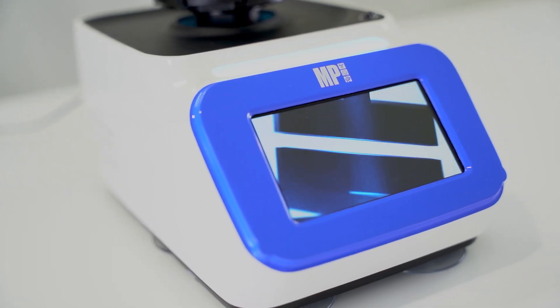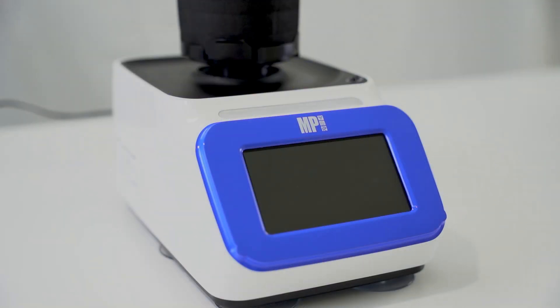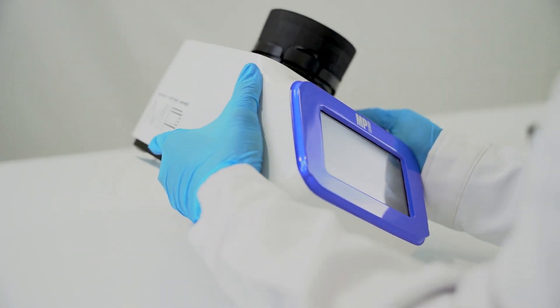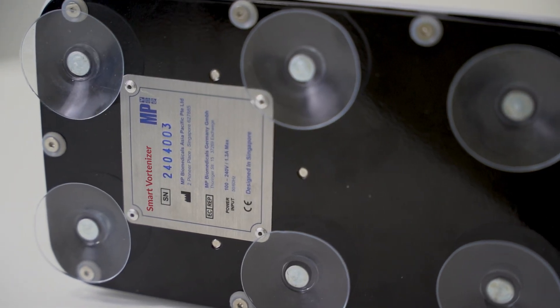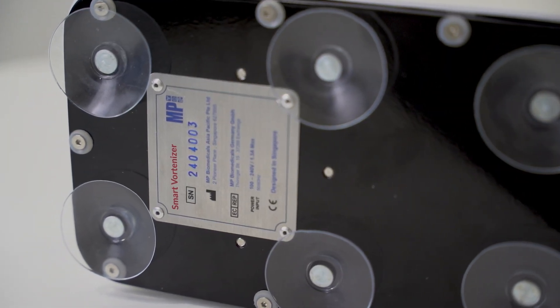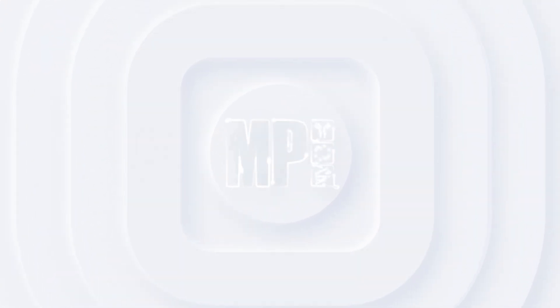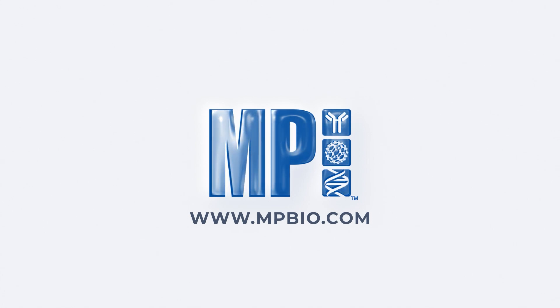Make sure that the instrument is completely dry before switching it back on. If a malfunction occurs that cannot be resolved on the spot, take a photo of the nameplate at the bottom of the machine and contact MP Biomedicals' technical support. Our qualified engineers will be more than happy to assist you. For more information, contact us at mpbio.com. Thank you so much for watching.